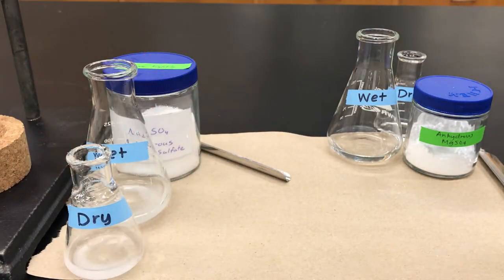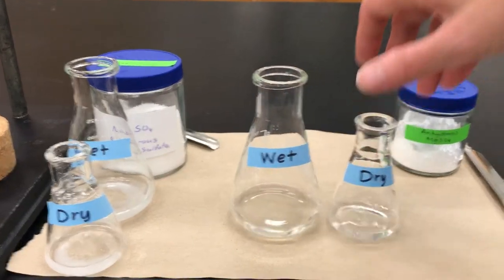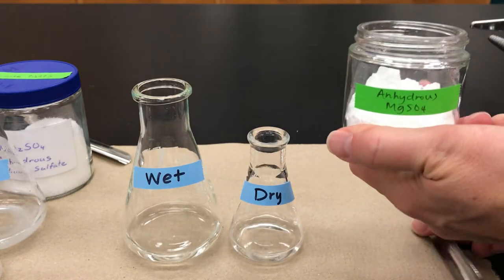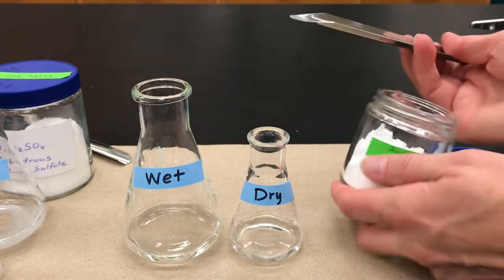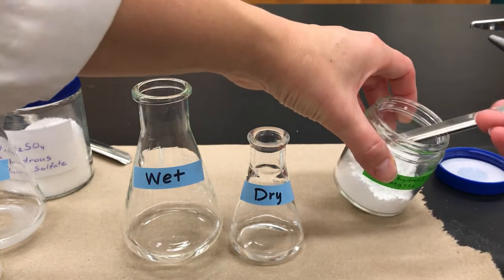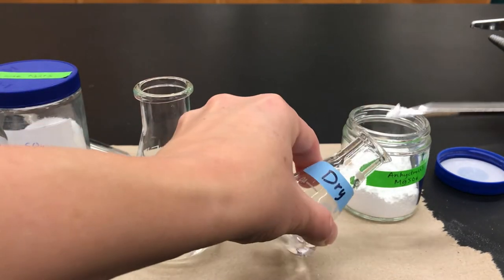Now let's do the same thing with the magnesium sulfate. Magnesium sulfate is going to look differently because it's more of a powder instead of sodium sulfate being more granular. You'll do a similar thing — add a small portion roughly the size of a pea and add that to your flasks.